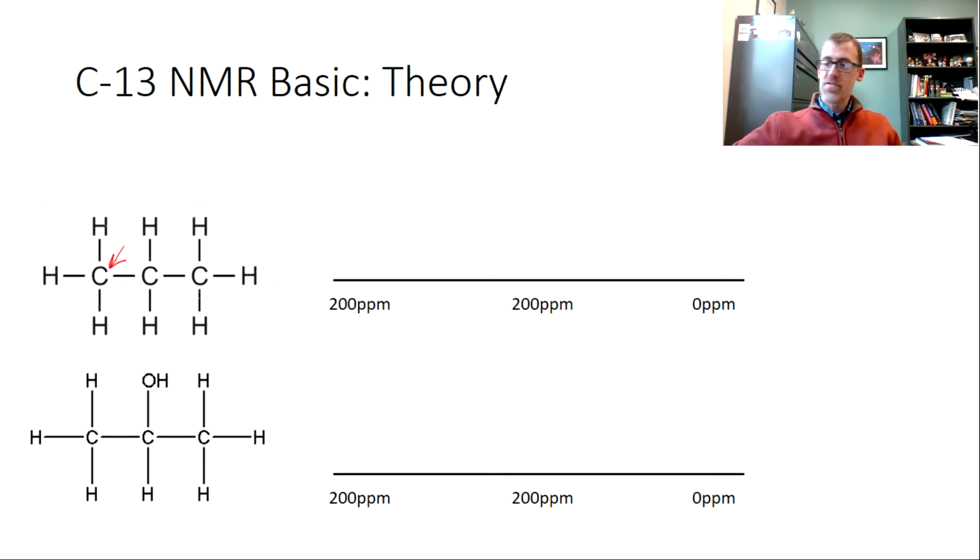And that being the case, the scale, you'll see on this axis 0 to 200, it's not quite an arbitrary scale, but it's designed such that 0, at this end of the scale, would be the resonant energy for a normal carbon. So what's normal, and that's somewhat debatable, but if we have a carbon, let's say something like methane, let's just make it as simple as possible.